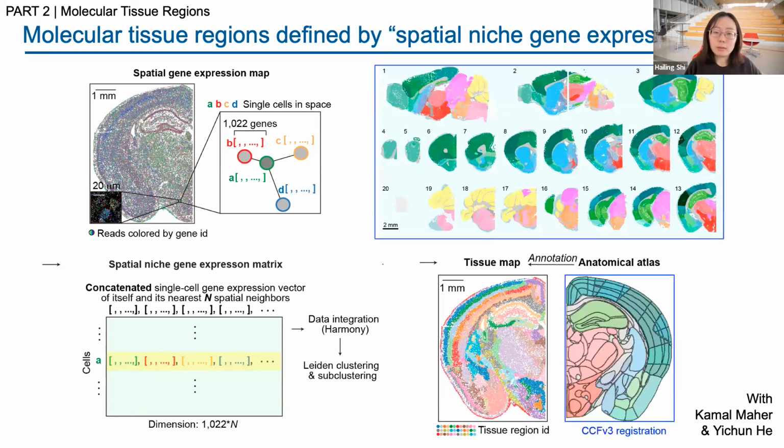And as mentioned, we can compare this molecular definition with the anatomical definition after registering our sample into the common coordinate framework.